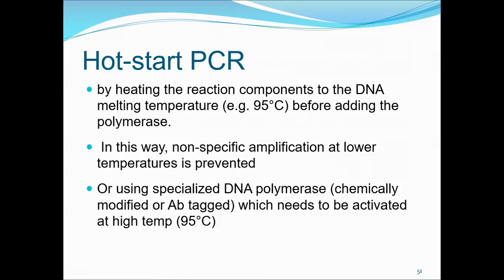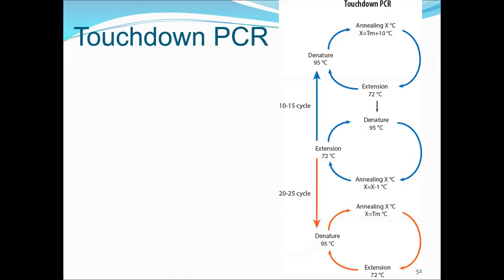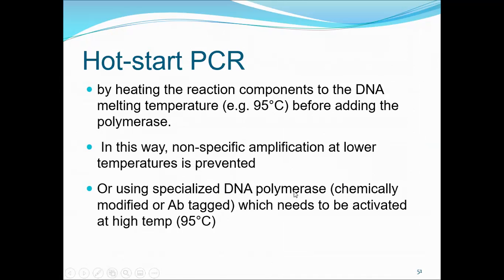But this would be a tedious job, so better you go for the chemically modified or antibody modified specialized DNA polymerases, which need a higher temperature with some longer time to get denatured, to get activated.